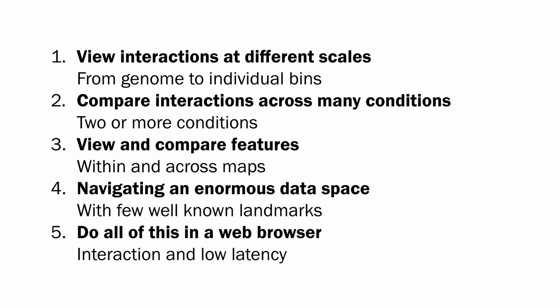Like what I told you about the tracks, they're stacked on top of each other, and when you have tracks that represent different samples, say, epigenomic markers, say maybe some histone modifications, and you compare them in different cell lines, you can compare across, and you can start to interpret what's going on, right? So that's why we want to compare.